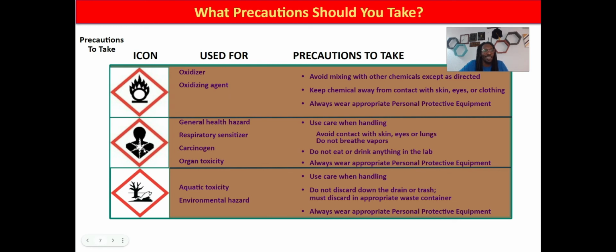This one is giving me some type of chakra vibe. I don't know why it looks like that, but this is a general health hazard. So it's really related to carcinogens or something to do with your lungs, or it can cause impact to your organs. You definitely want to be careful with these.